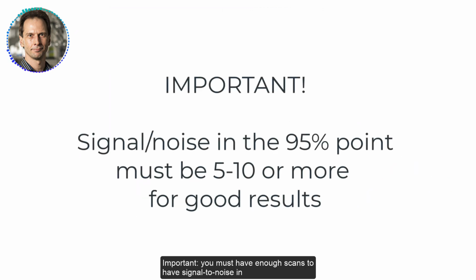Important: you must have enough scans to have a signal to noise in a 95% spectrum of at least 5 to 10.